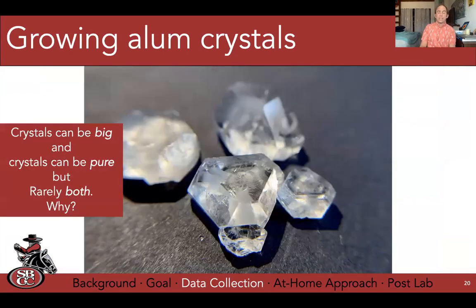Really straightforward this week on what we're actually going to be doing. How we get there is a challenge that's up to you. Crystals can be big and crystals can be pure, but rarely both. Why?